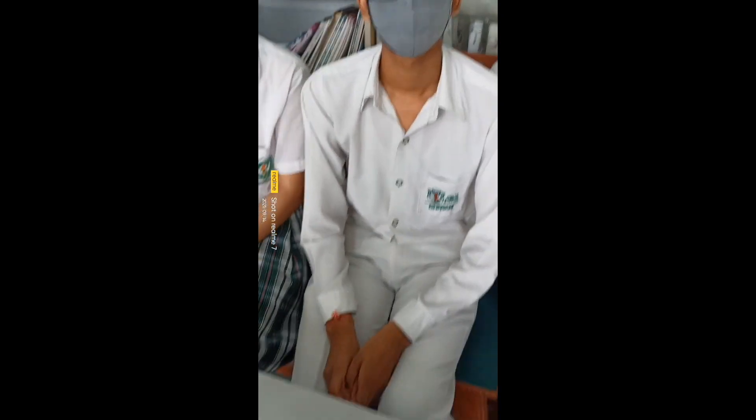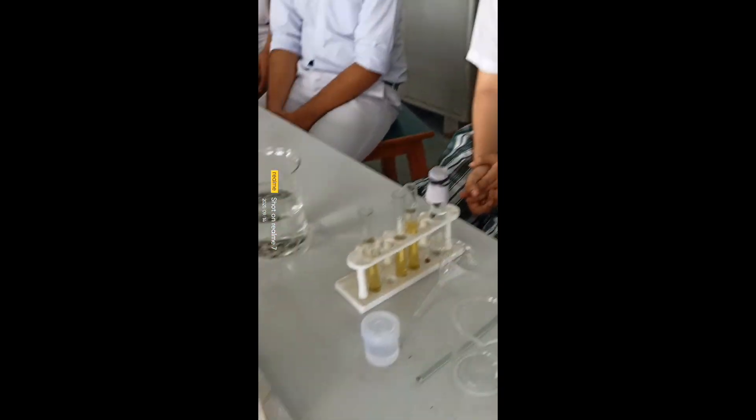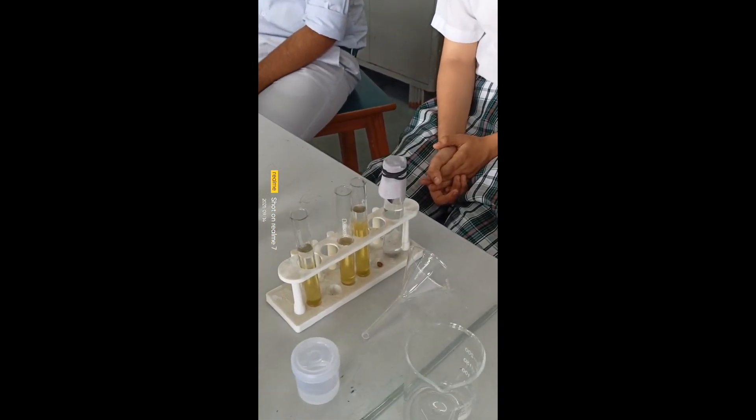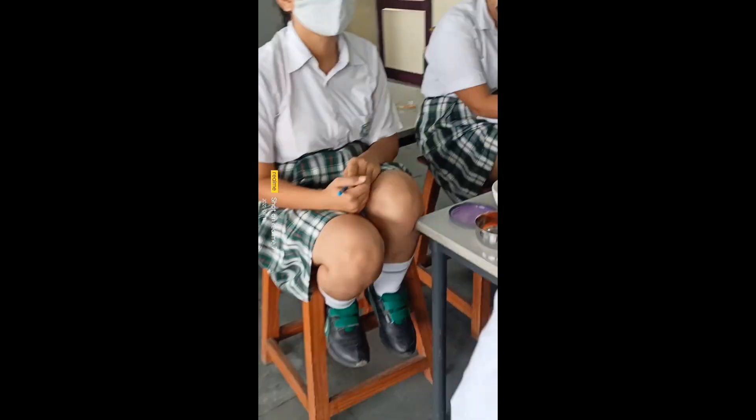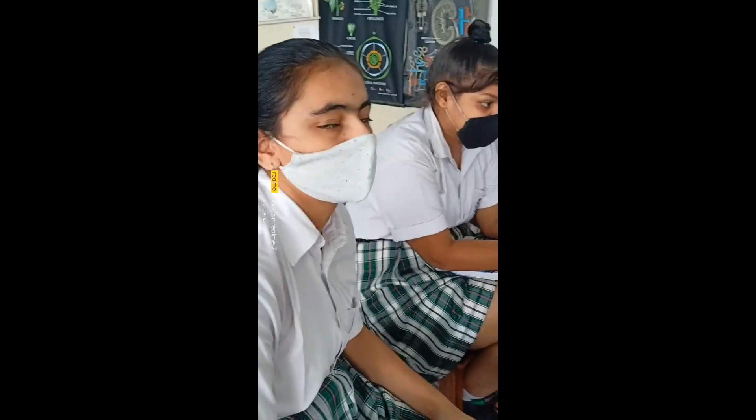This is the next group — they have done DNA isolation from pea. The materials used are the same. Here is their result: they had taken very little pea, so the DNA is a very small amount visible as a white precipitate. It's not so clearly visible in the pea sample.